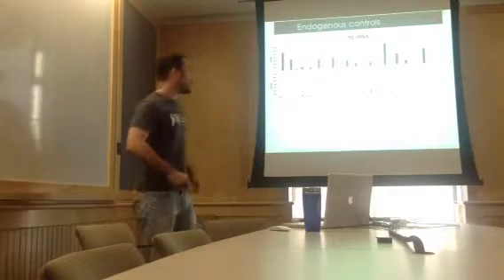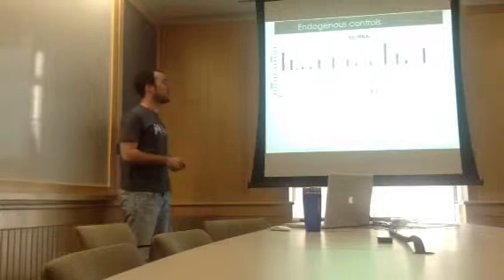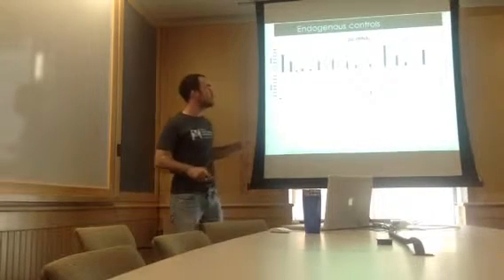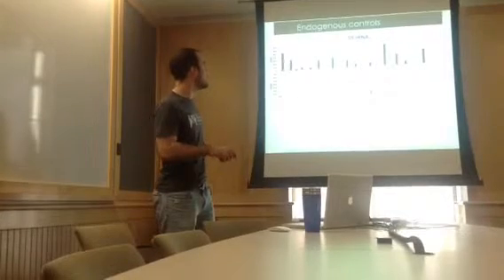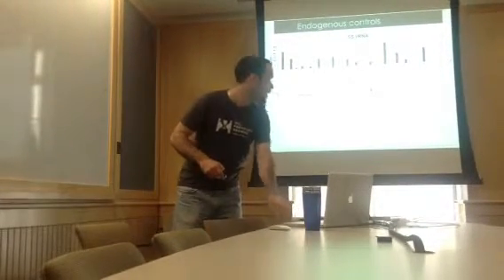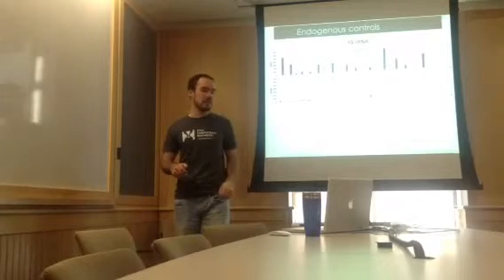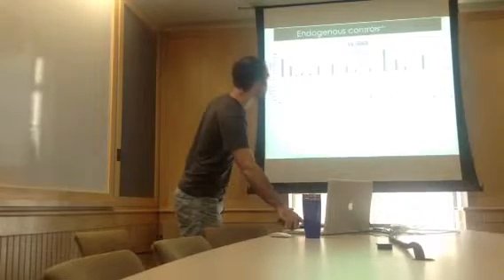So I showed you some primer extension on the 5S ribosomal RNA. And here, these are normalized values, so we can theoretically compare the intensity of the peak between 2 lanes. And we can see that the in vitro, again, is really more accessible than the in vivo, which makes sense because it's in the ribosome. And when we look at the highest peak in vivo, it corresponds to the same highest peak that we have seen using primer extension. So the data at this level seems to correlate.